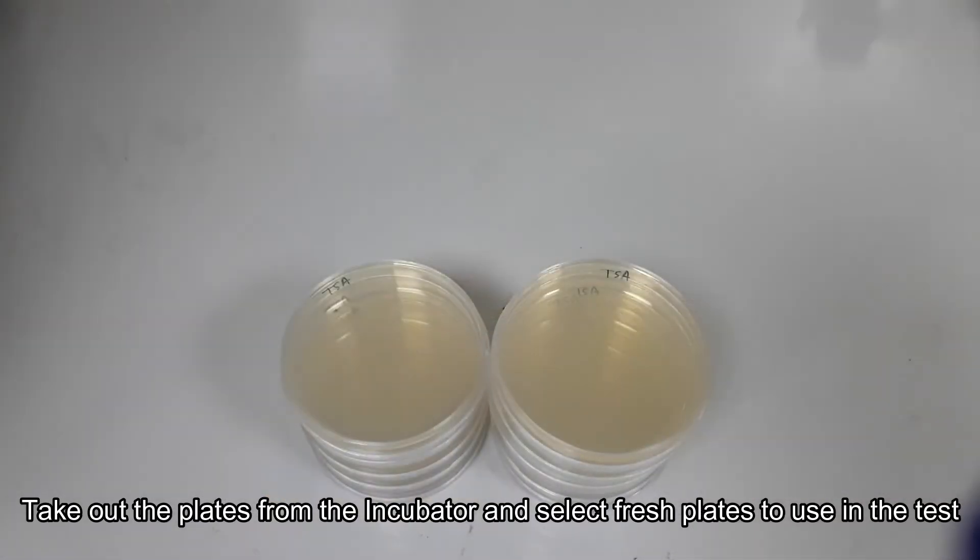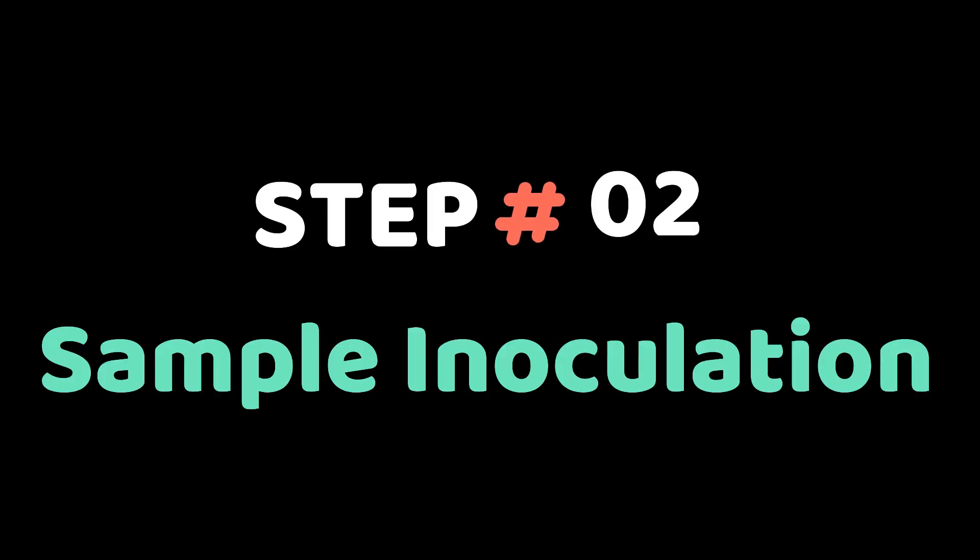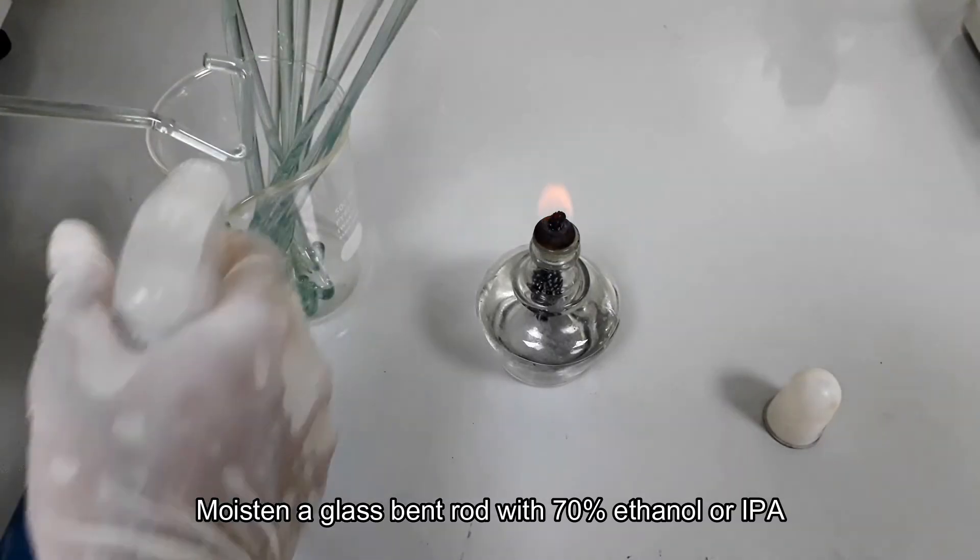Incubate the plates for contamination checking. After incubation, sort out the fresh plates for use in the test. Now we are going to inoculate our sample into the previously prepared culture media plate by the spread plate method.